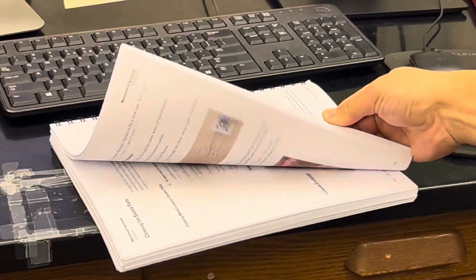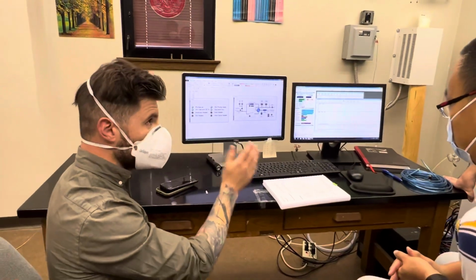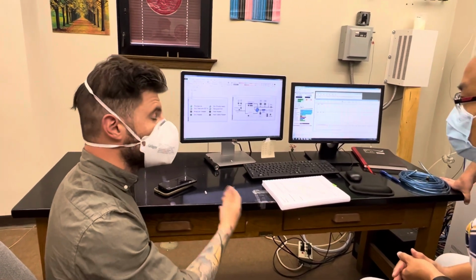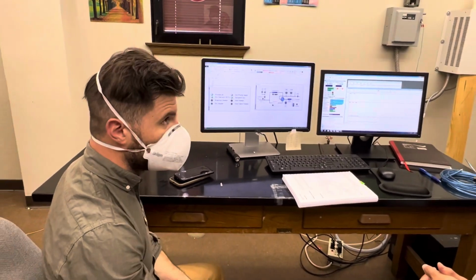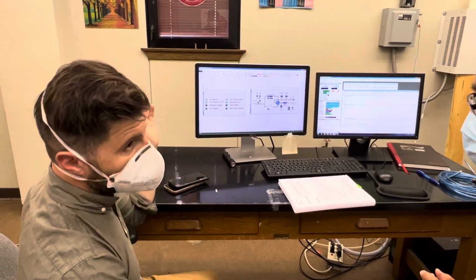And it depends on the peripheral. So the amount of background you get from the conflow and GC will be different than the amount of background that you get from the gas pump. So maybe that would be another thing you'd write down. And maybe every quarter, I would just plot all that stuff on Excel and see if there's a trajectory or see if there's an anomaly.